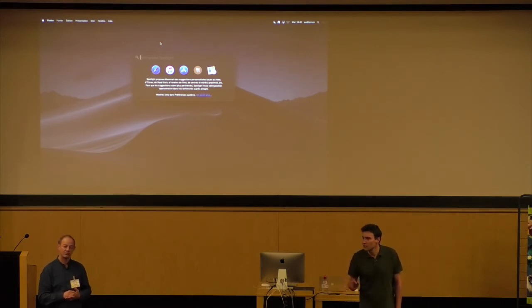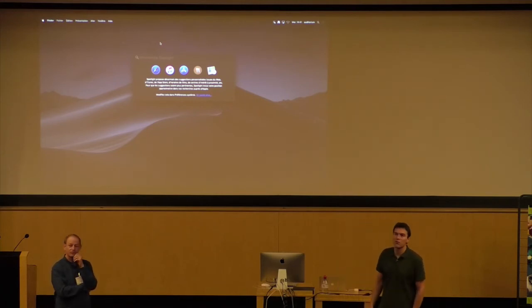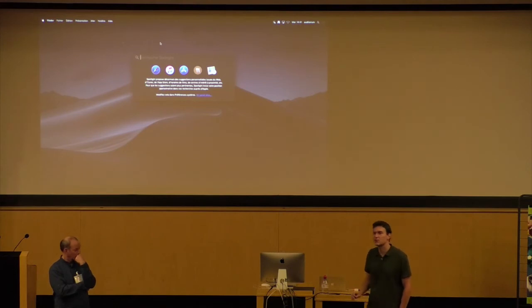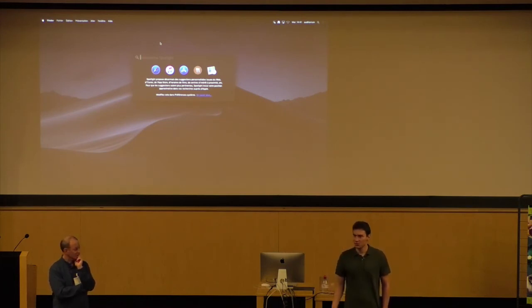But if everything works fine, it's okay. But if I wait too long, I see in the microscope that there is a background. What can be done? What I was doing in the past sometimes is the whole system is preloaded with water, because if it would be air, you cannot really manipulate nanoliters, right? And then, after putting the sample to the grid, you can just add a little bit of water to compensate this evaporation. Just maybe 1-2 nanoliters after your 20 nanoliters of sample. And this can maybe already help you in some cases to compensate this increase in concentration.